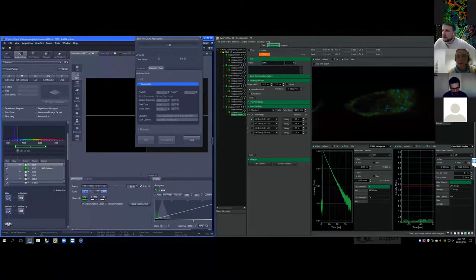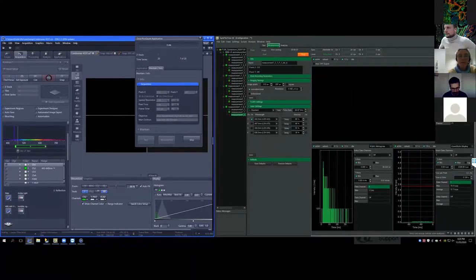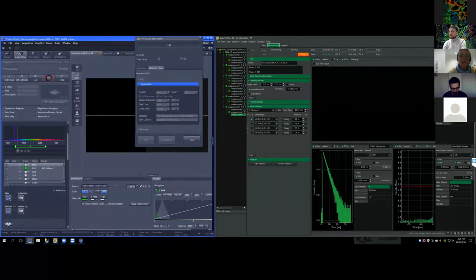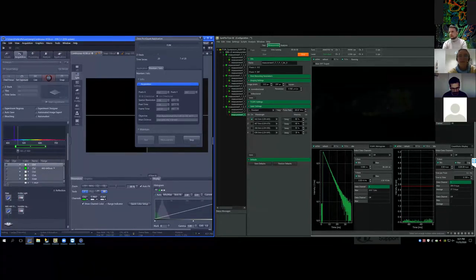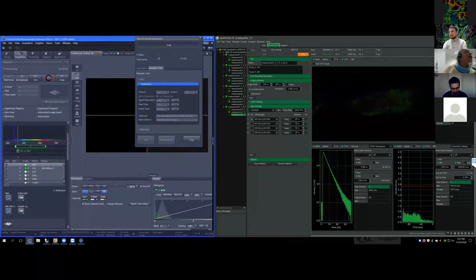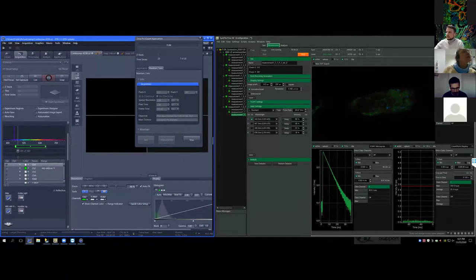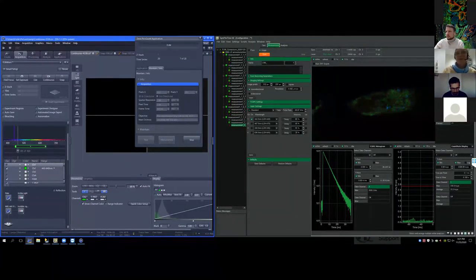There's a question about calibrating pH values against lifetime. We tried calibrating with buffer, but the lifetime in buffer is not exactly the same as in cells — in cells there are many other environmental factors, so it's much more complex. The lifetime in cells is a bit lower than in pure buffer solution. We haven't found a reliable way to calibrate it. I just added the ammonium chloride. We're seeing quite a lot of bleaching because we used fairly high laser power for short acquisition times — but we may still see the pH effect in the recorded images.